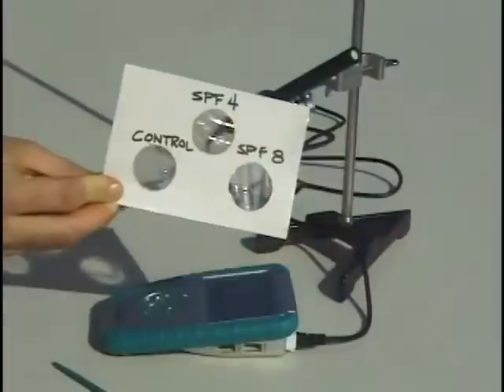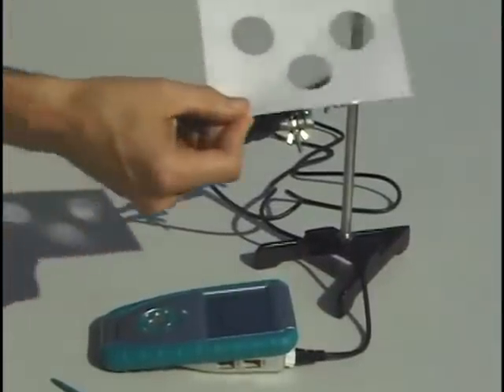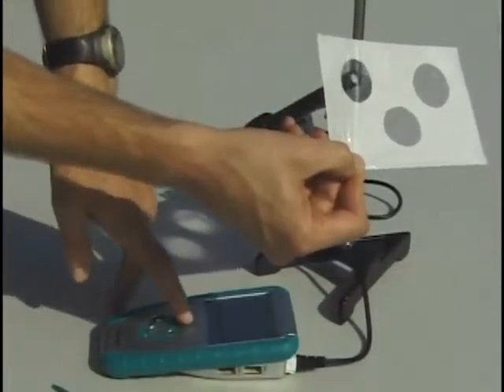Now we get our card ready with all the different UV values, and we need to make sure that we keep the sunscreen on the side away from the sensor so that we don't get any of the oils on the tip of the sensor.